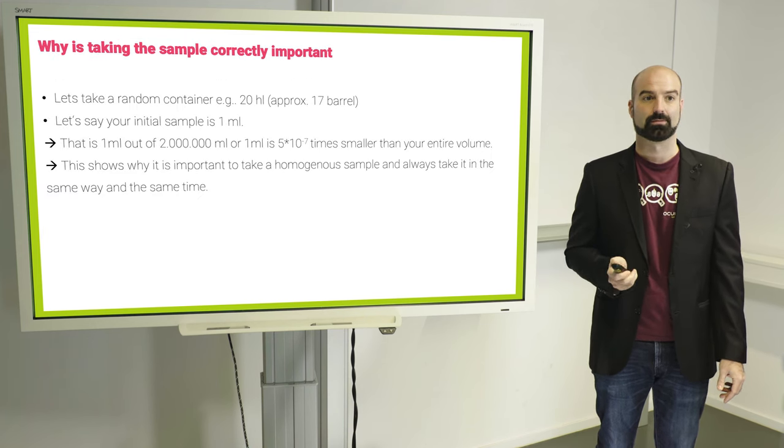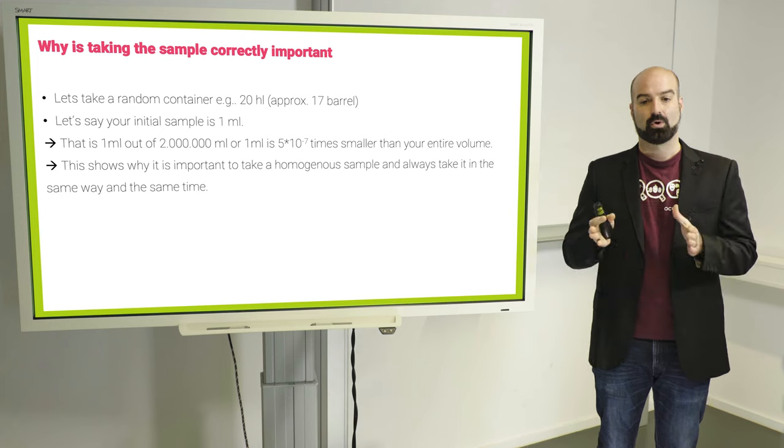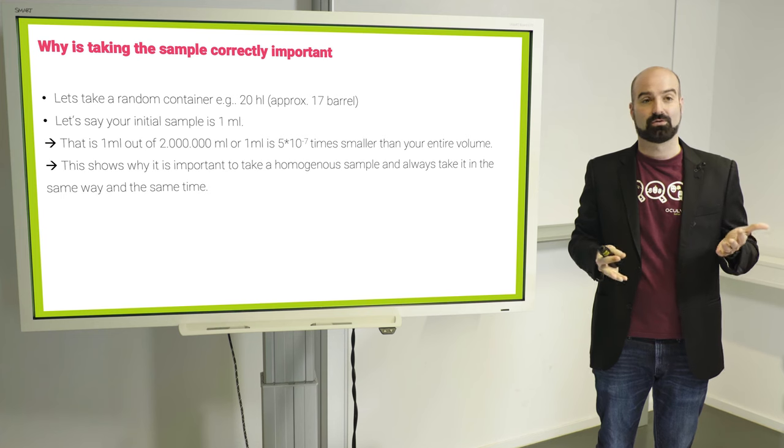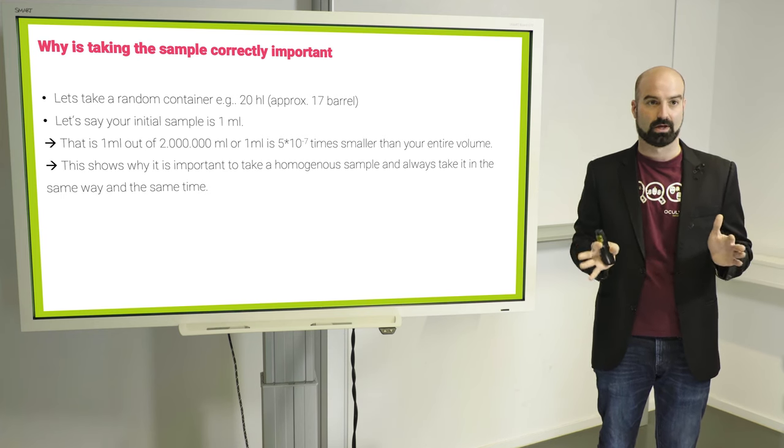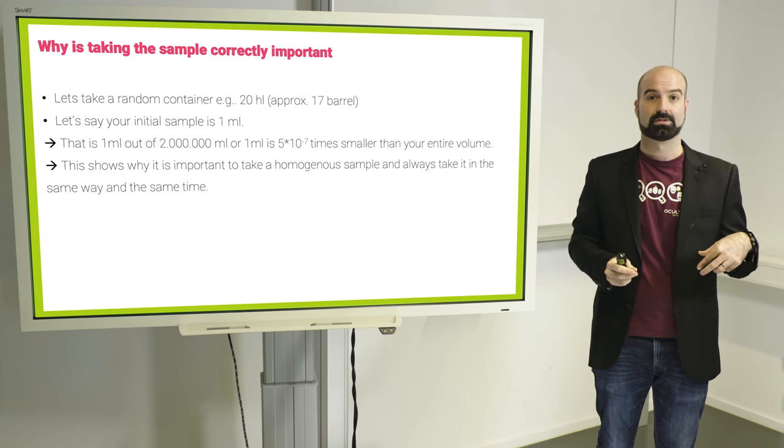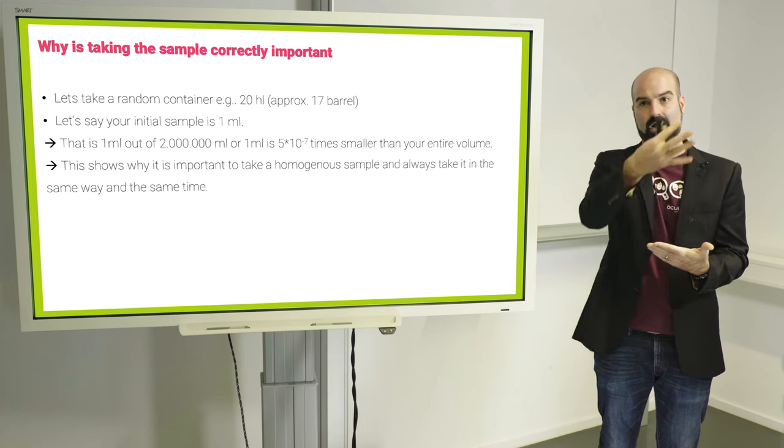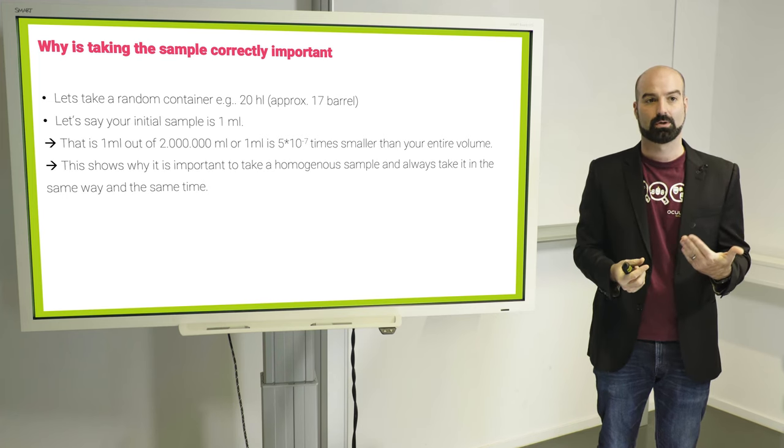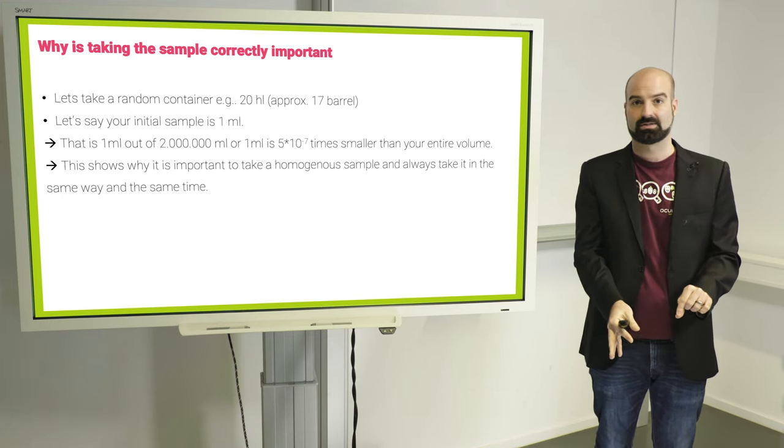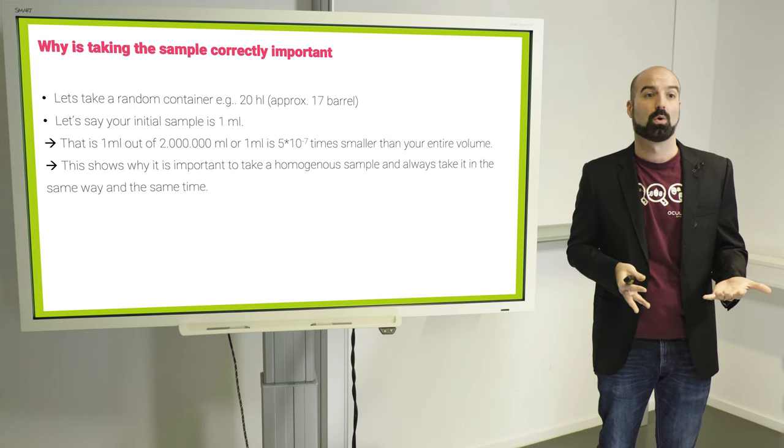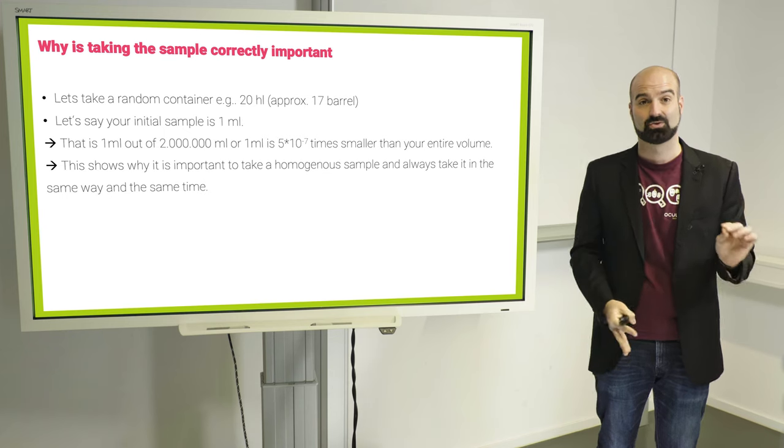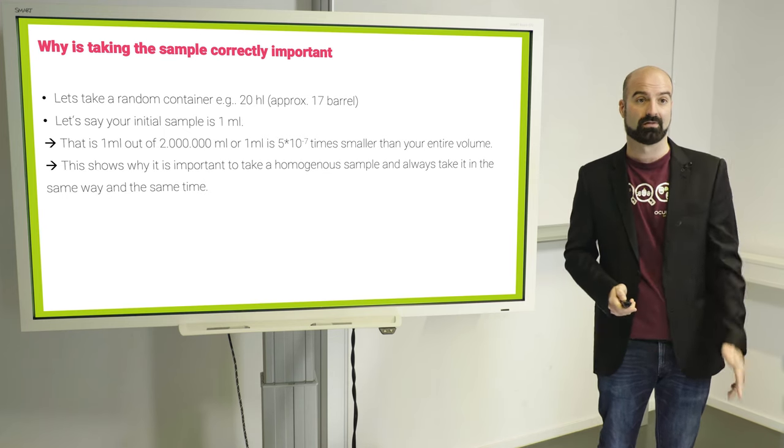First off, not taking a representative sample of your yeast. It is very important that the sample you take is actually representing the rest. Let's say you have 20 hectoliters or like 17 barrels if you don't like SI units. And your sample that you're taking is one milliliter. This is like half of a millionth of your actual volume. So if this volume was taken at the very top and the rest of the yeast is settled or at the very bottom, when it's settled, it will not represent your tank as a whole. So it's important to either mix it or at least have homogeneous or at the very least, do it the same way every time so you can compare values.